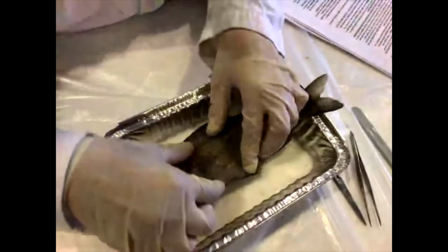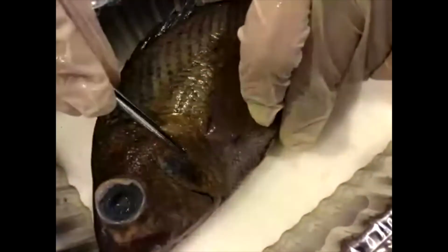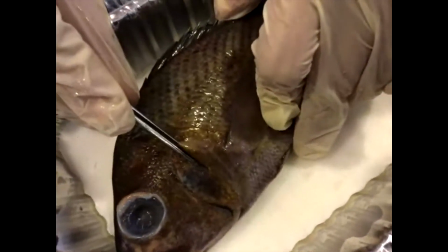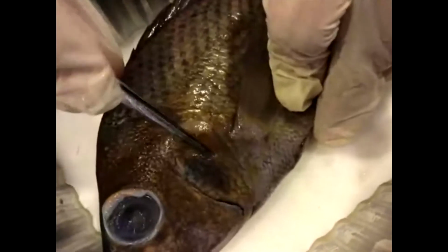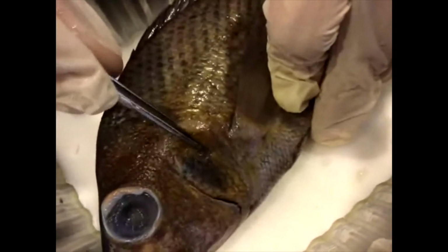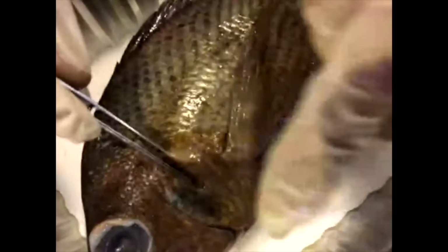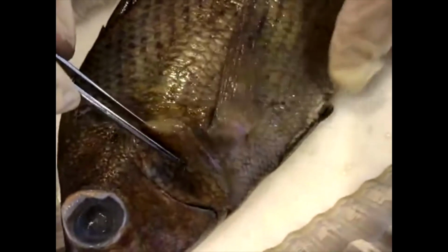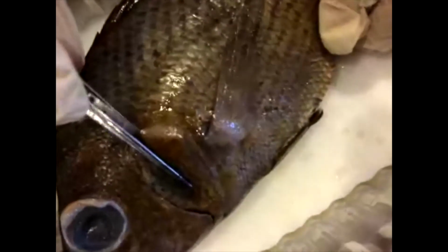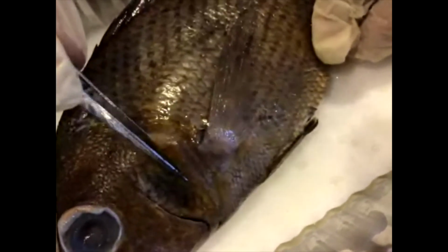All right, the next thing I'm going to show you here, I'm going to need my forceps. There's a little flap here right before the fin, and it's really hard, but maybe you can see me pulling it up like this. And this is called the operculum. And when the fish is alive, you might actually see this moving up and down like this. And what it's doing is the operculum covers the gills. And so when the operculum opens, it's doing the same thing that the gaping is. It's bringing water into the gills, and then the water will rush over the gills so that it can absorb the oxygen and then transfer it to its blood. So this is our hard bony piece. It also protects the gills because the gills are a really important structure.